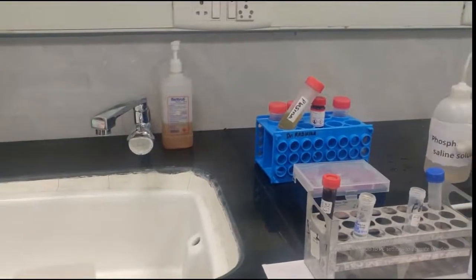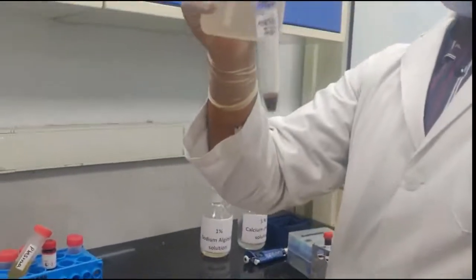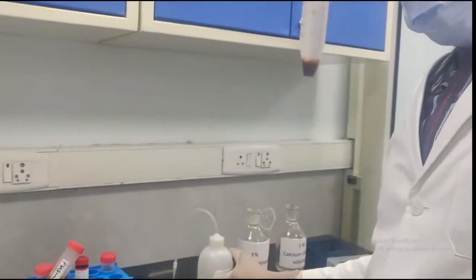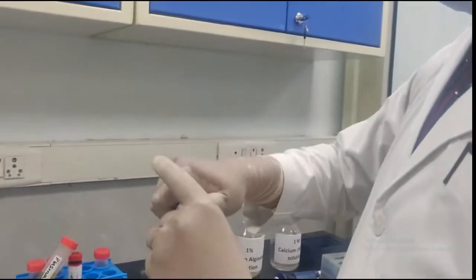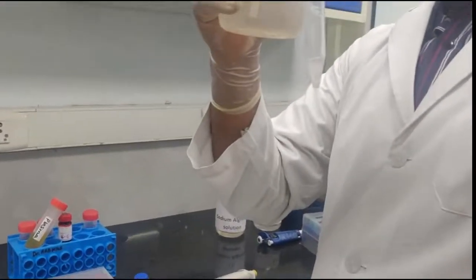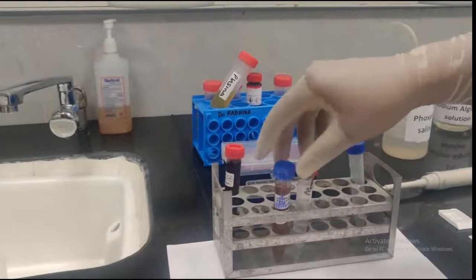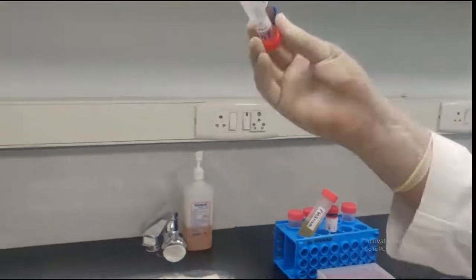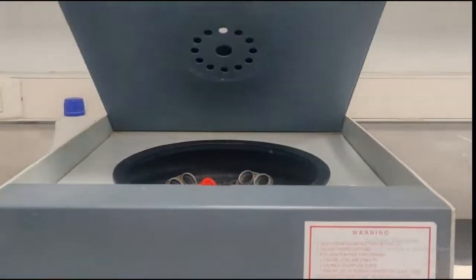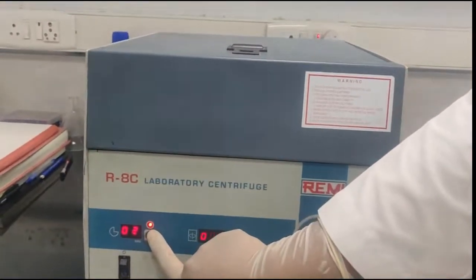And phosphate buffered saline will be added to these pellets. Similarly to the next sample. So this phosphate buffered saline is being added. After adding phosphate buffered saline, these tubes have to be centrifuged again at the same speed, that is 1500 RPM for 10 minutes or 3000 RPM for 5 minutes.